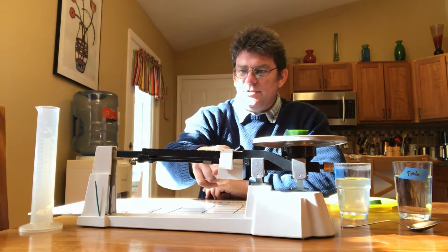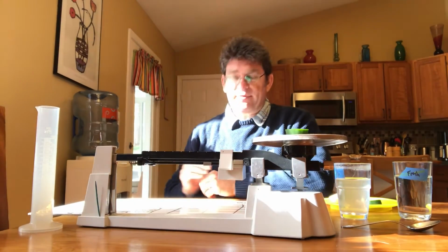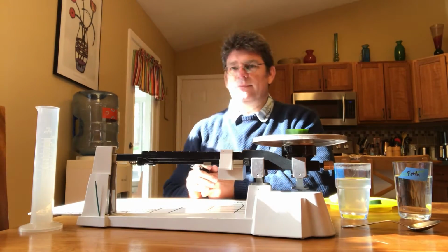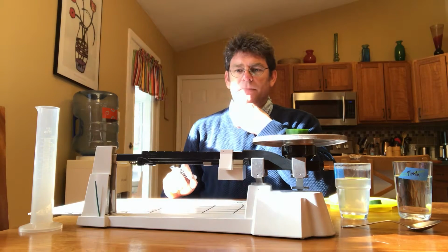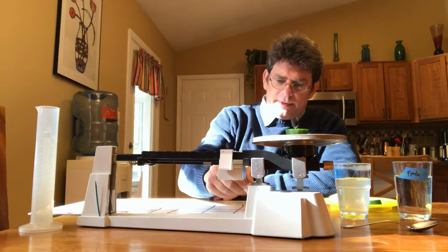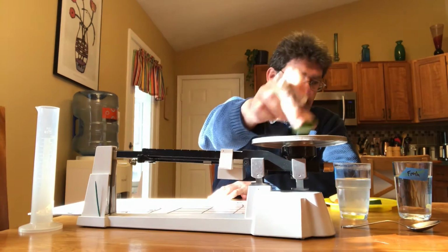So as I do this, let's think about what our hypothesis might be, right? I've got an if and a then. If I put the veggies in fresh water, then will they gain weight, lose weight, or stay the same? What do you think? That's kind of the question. All right, so this first cucumber looks like it weighs exactly 14 grams. I'll put it in my chart as 14, and I'm going to drop it in the fresh water.